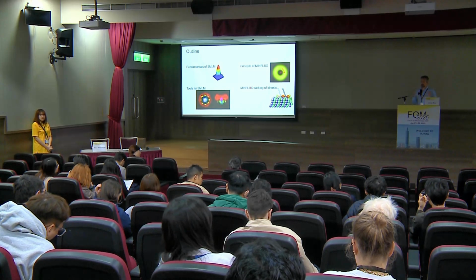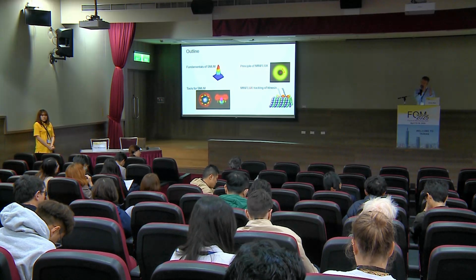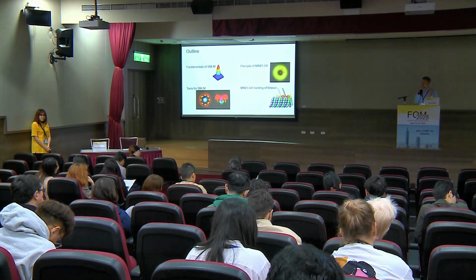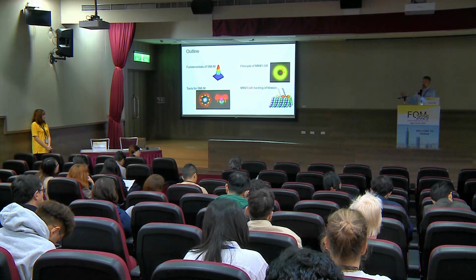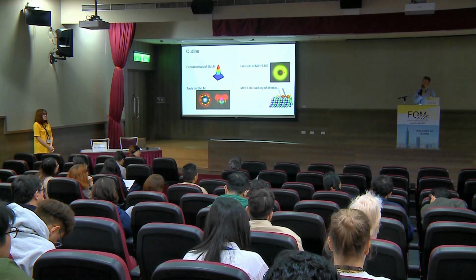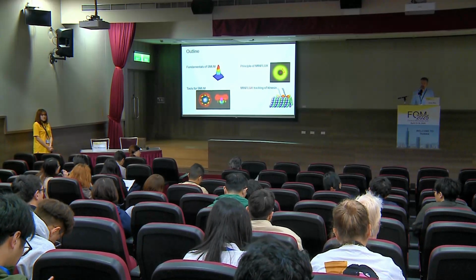For example, for the multicolor imaging, we now chose a dichroic that splits quite in the blue, so it transmits quite well Alexa 647, but not so much CF660C, also one of the dyes. And most of the photons are detected in the long channel. So if you want to be really sure to avoid any kind of aberrations, we take the position information only from the long channel and use the short channel to assign the color. So this is something one can do. I'm so glad to know that.